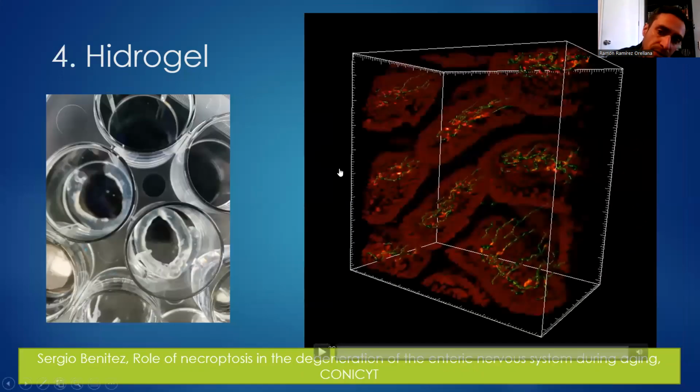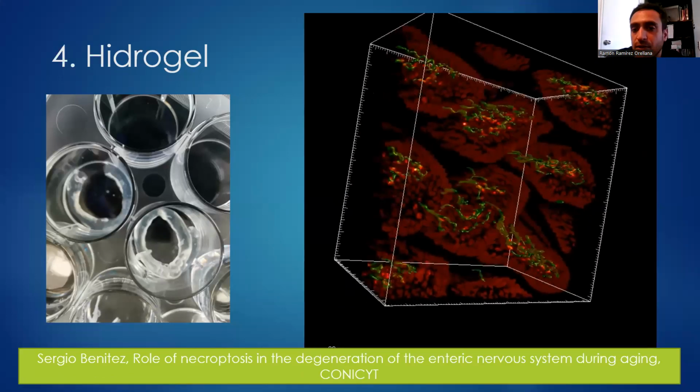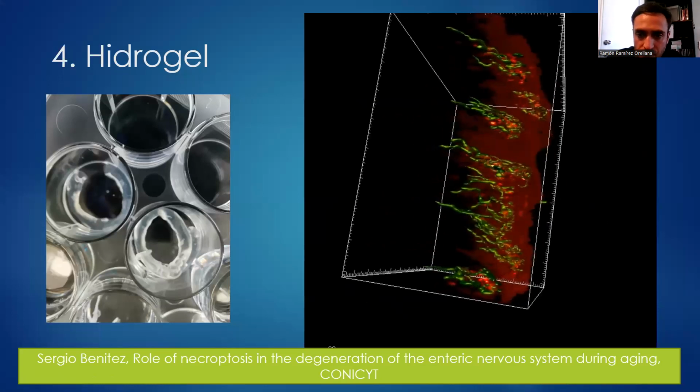Donde no existe problema es en el intestino. El clarificado es extremadamente rápido, queda muy transparente y la penetrabilidad del anticuerpo no tiene mayores problemas, ¿ya?